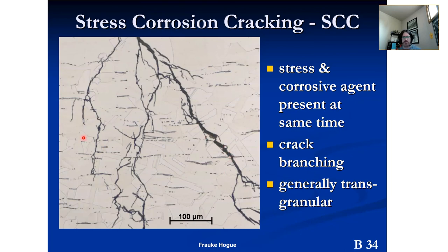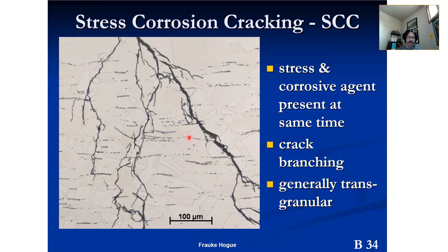Here's an example of stress corrosion cracking — we've etched the specimen. This is likely austenitic steel. The cracking is generally transgranular, and you can see this is a really good example of transgranular cracking. Frauke Hogue provided these slides. Stress corrosion cracking is another classic example of using metallography in failure analysis.